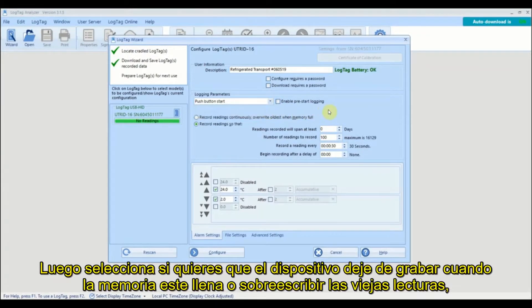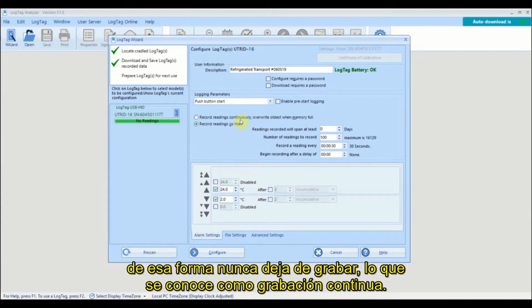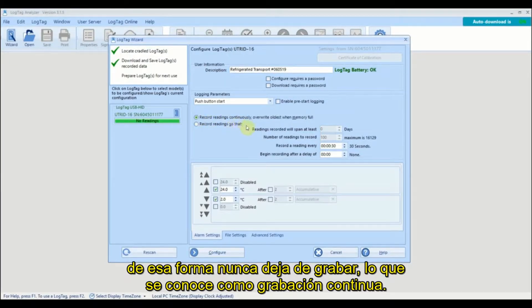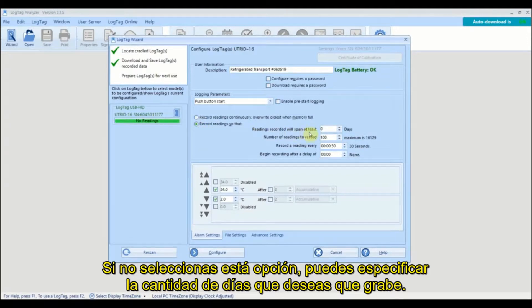Next select whether you want the logger to stop recording once the memory is full or to overwrite the oldest reading so logging never stops. This is called continuous recording. If continuous recording is not selected, you can specify the number of days you wish to record for.